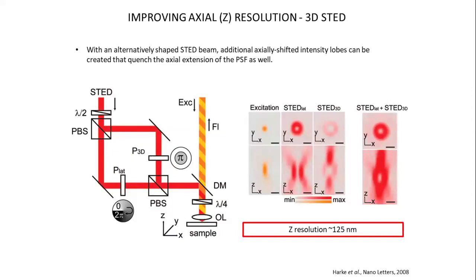It's got a wave plate, which basically takes a plane wave and shapes the wavefront in such a way that when it comes to focus, it makes a donut. That's there. So it's really simple. We just have to put a wave plate in there, one component, to generate that donut beam.